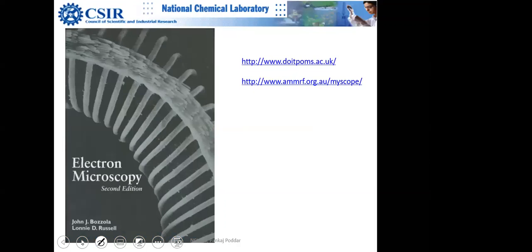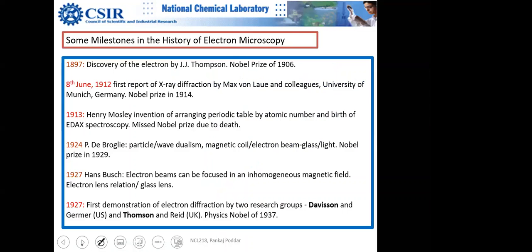If anybody among you is planning to do experiments on live cells, or not live cells basically, you can't do it using this technique. Using atomic force microscopy, you can probe live cells, but here you would like to fix the cells. Those techniques of processing mammalian cells or microbial cells are in this book by Bozzola and Russell. It's a great book, the only book required for biologists. Okay, so let us look at it one by one.